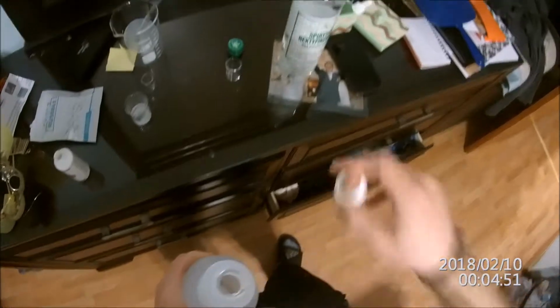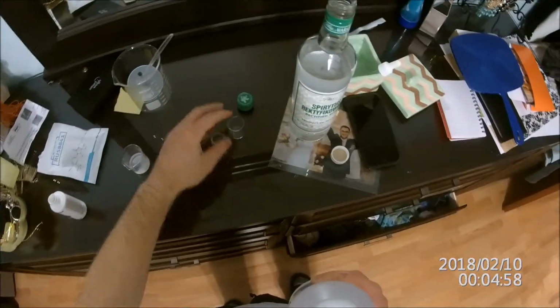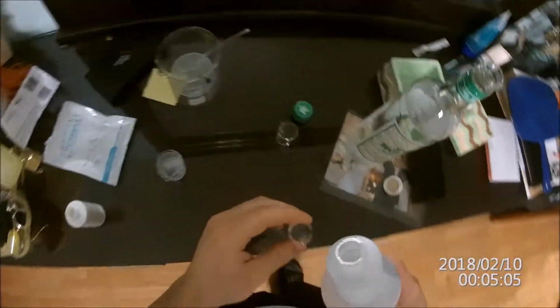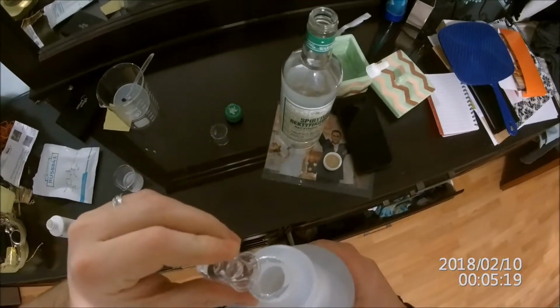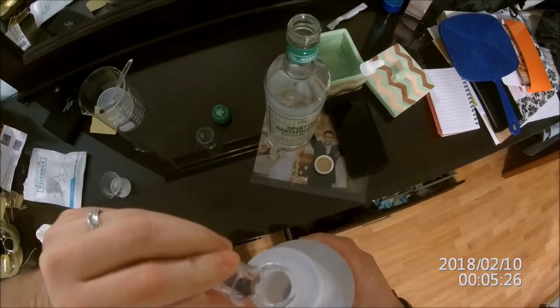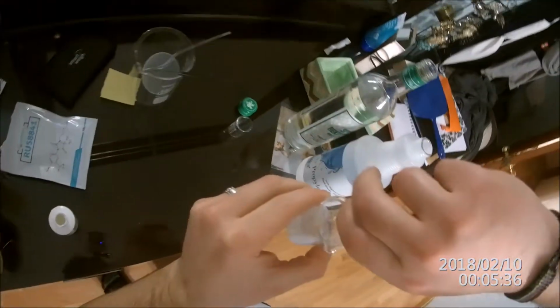So I need 5 milliliters of this. I have an even smaller beaker, believe it or not, like these tiny beakers, that goes to exactly 5. So I'm going to use this beaker to measure. And it's much easier to throw in the propylene glycol because it's a little thicker in consistency. Yeah, so I threw in a little bit more than 5. See if we can take that back out. Yes. A little bit more. Okay. Yeah, perfect. 5. So, got the ethanol. Throw in the propylene glycol.